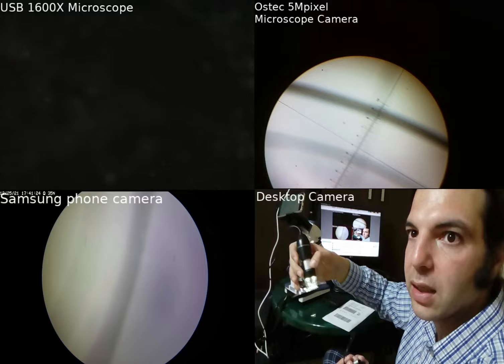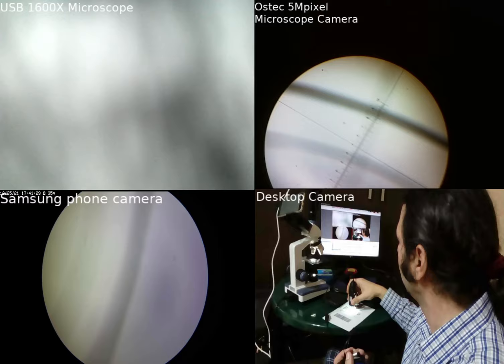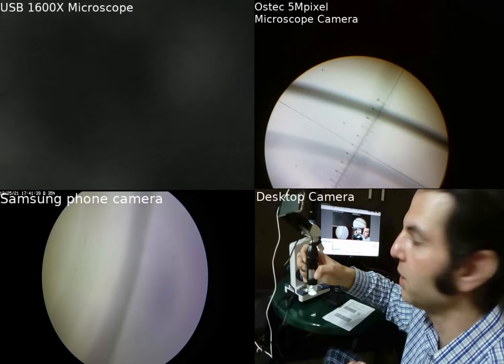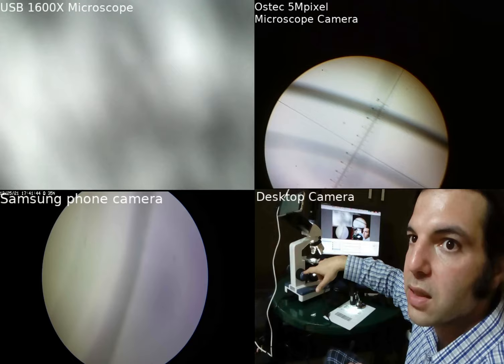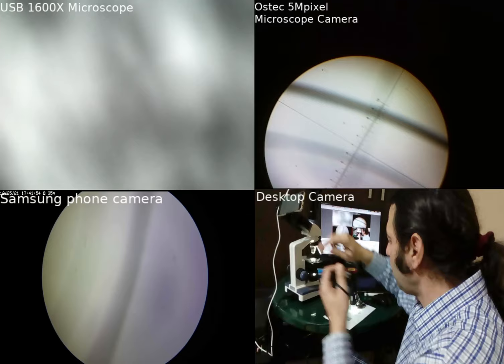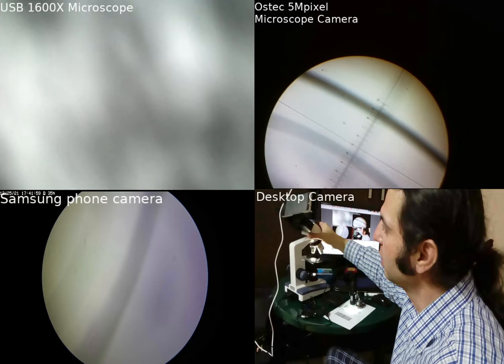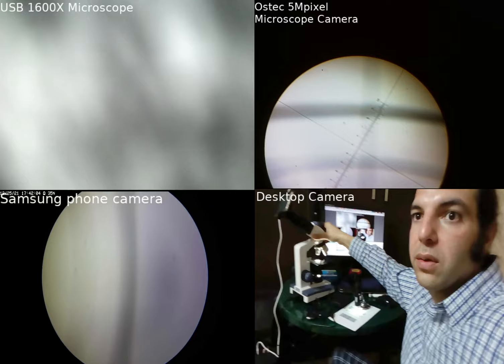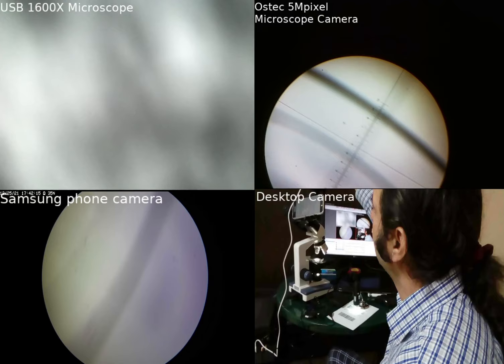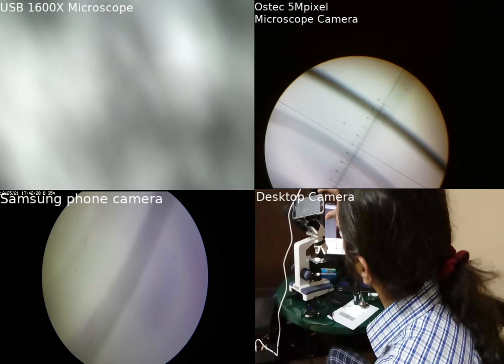Some microscopes can run on Wi-Fi. This dial here is just for zooming in and out — going one way zooms out to lower magnification, going the other way goes to higher magnification. Here I have dials for fine-tuning. I have a camera here and a camera here. This is a trinocular — it has a binocular in the front. I'm attaching a mobile phone here as well.